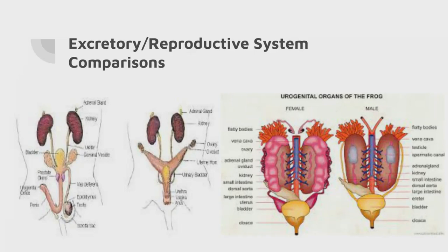In frogs, the main components of the excretory system are kidneys, a pair of ureters, a urinary bladder, and a cloaca. The kidneys have the same function in both frogs and rats. In frogs, the kidneys are more elongated and flat, located above the coelom. The ureter stores sperm and urine in male frogs and just urine in female frogs. The urinary bladder is a large structure that has thin walls. There are multiple tissue layers inside of the bladder.